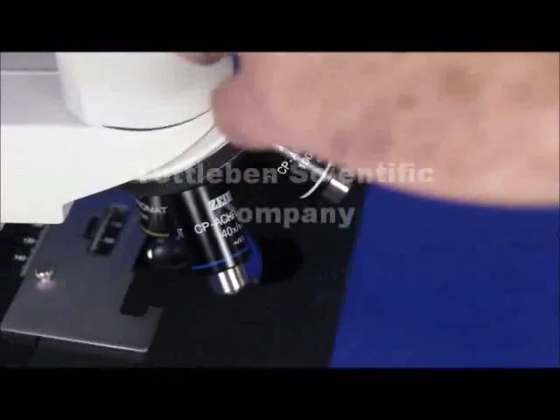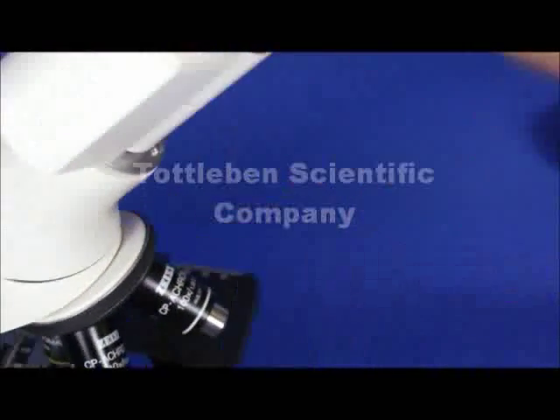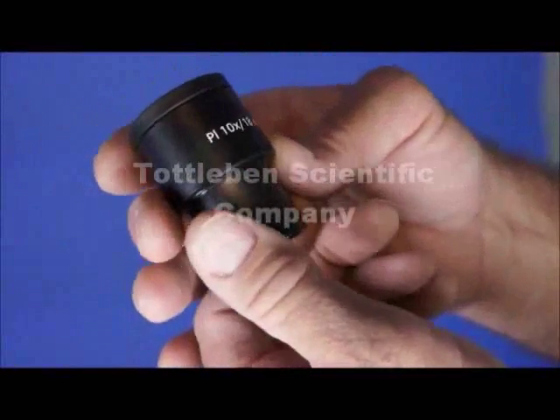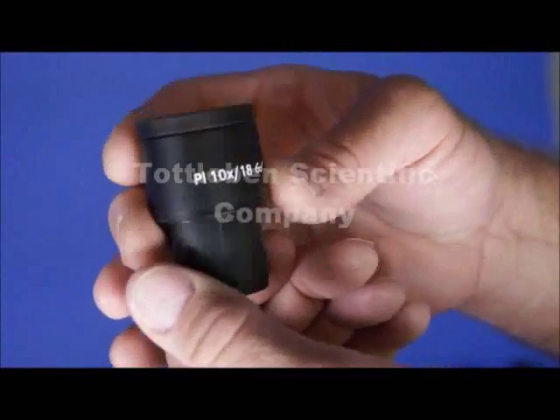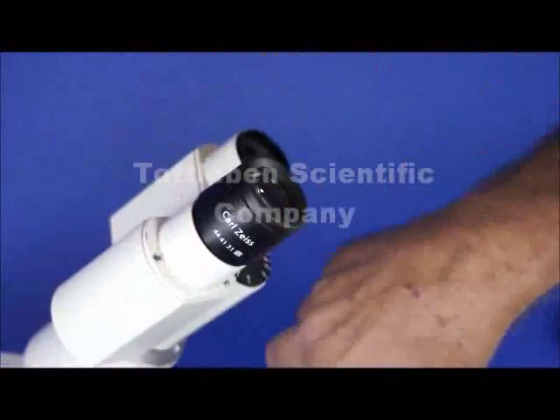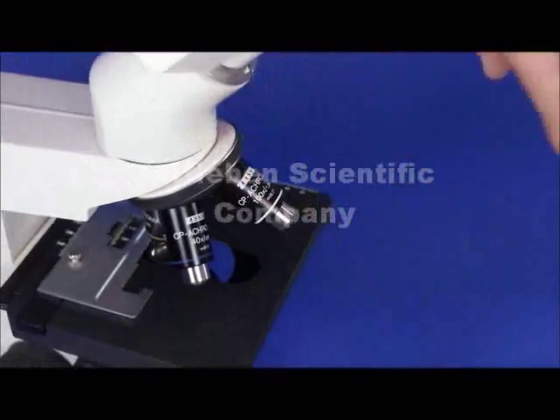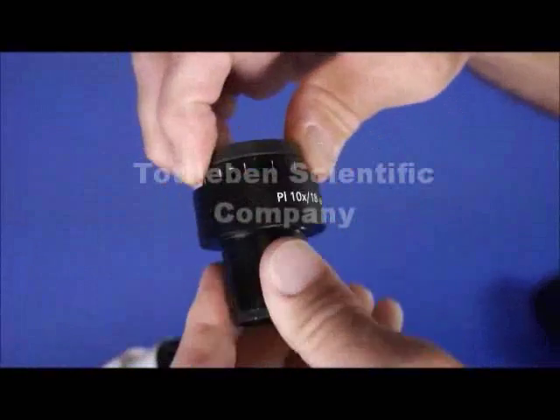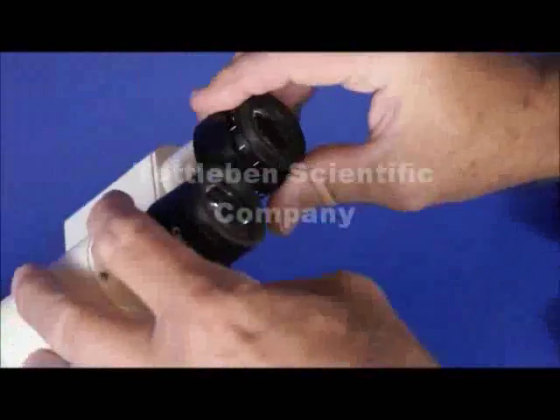Talking about the eyepieces — these are Zeiss 10x PL 18s, high eyepoint eyepieces. They are also highly corrected to match the correction of the objective lenses. The right one focuses so you can maintain parfocality between the eyepieces and maintain proper visual acuity.